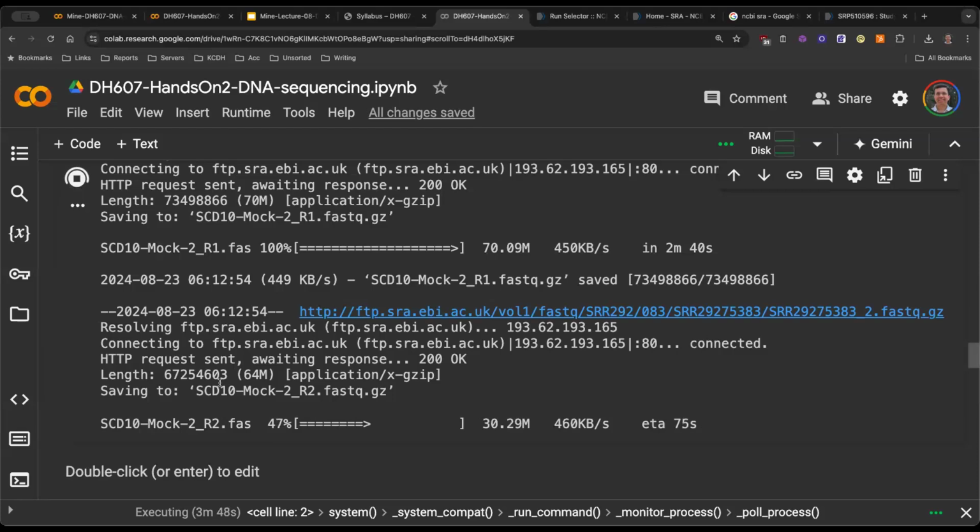You can have a different scenario, where this is your R1. This is 150, but your fragment is actually much smaller, so maybe it's 70 nucleotides. This is your insert, or your fragment. I will keep using these terms interchangeably: fragment or DNA insert are the same thing. So you will only see a 70 nucleotide length sequence here.